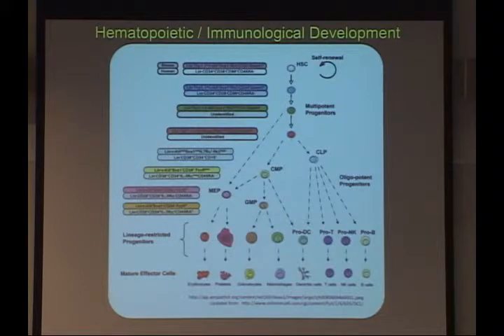So with this many parameters now available, at this point we were at between 30 and 35 parameters, Aaron and I both thought that we could do a pretty good job of capturing everything that happens here in a single experiment and have the ability to hopefully look at some signaling responses at the same time. And so what we did is we devised a couple different panels.